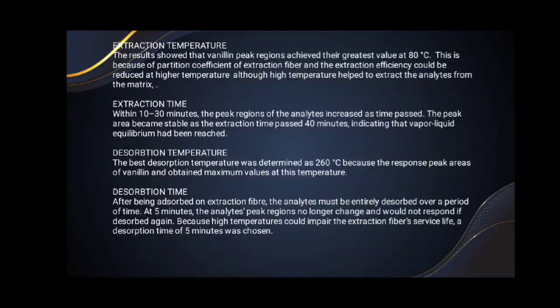Extraction temperature. The results show that vanillin peak areas achieve their greatest value at 80 degrees Celsius. This is because the partition coefficient of extraction fiber and the extraction efficiency could be reduced at higher temperature, although high temperature helped to extract the analytes from the matrix.